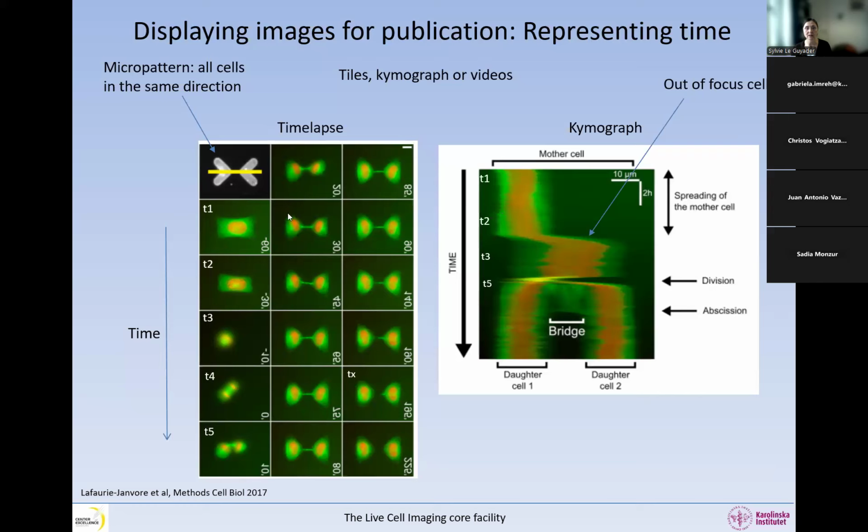So you can see that we would go into dark, dark, dark, green, green, green, green and red, green and red, green and red, green, green, green, dark, dark, dark. And that's exactly what you have here. So now you're in the background. Here you get to the cytoplasm of the cell. Here we're in the nucleus, the other side of the cytoplasm, and then background.